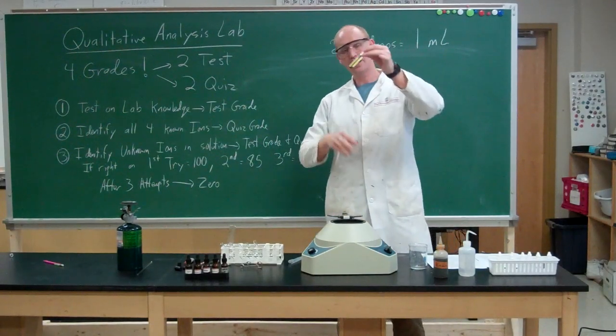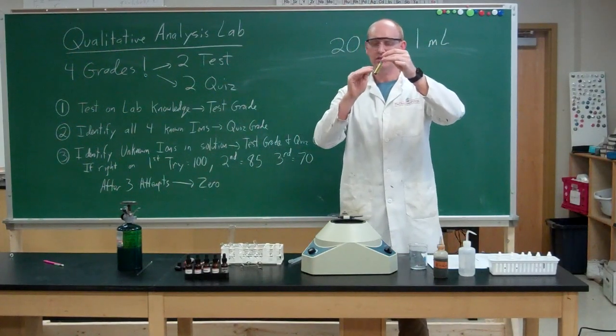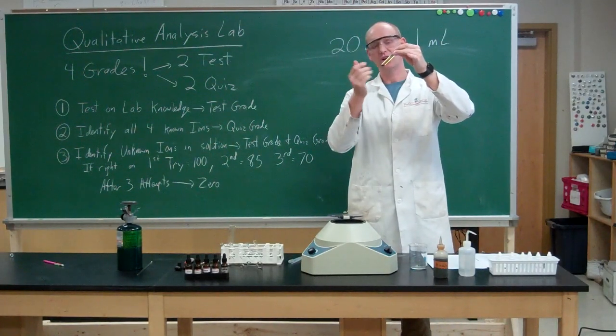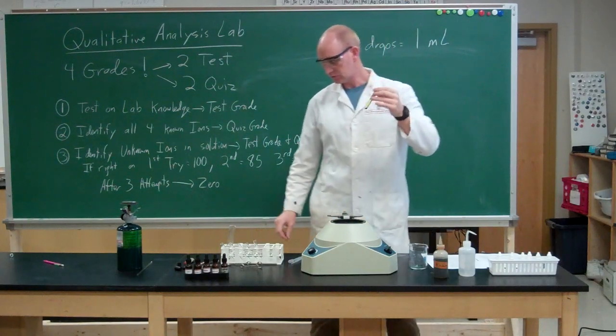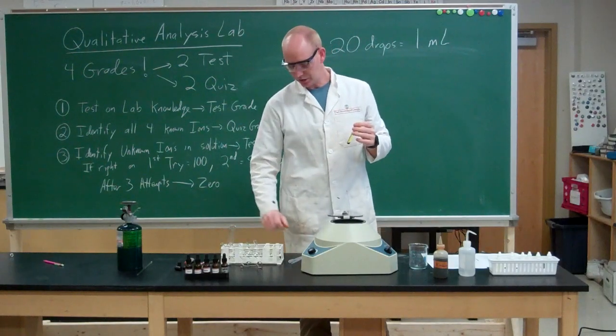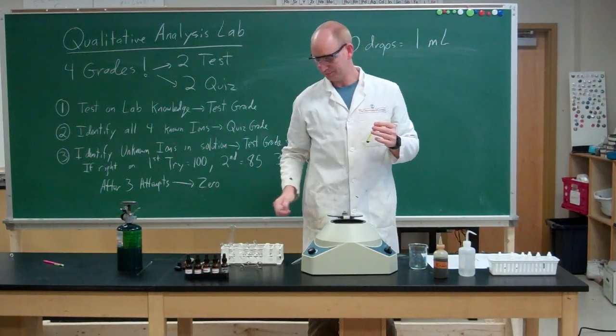And our filtrate has ions in it, looks like it has probably aluminum and chromium. Our bottom one has our nickel and our iron in it. So we want to separate the top layer from the bottom layer, and we're going to do that with a pipette.